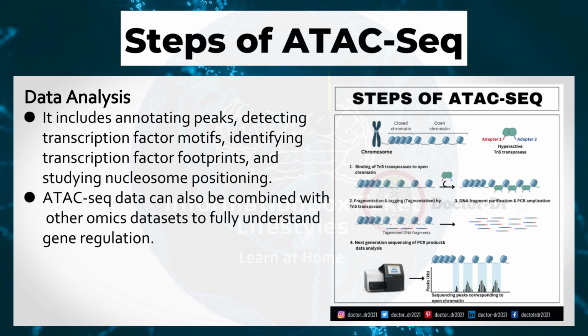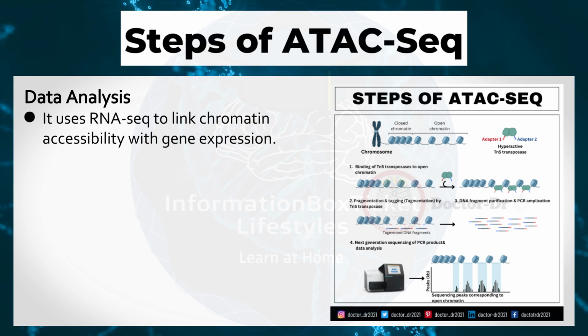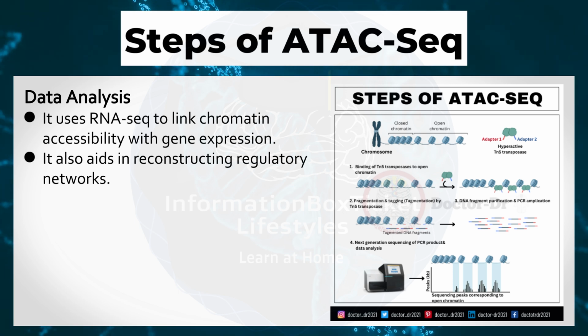ATAC-Seq data can also be combined with other omics datasets to fully understand gene regulation. Multi-omics integration enhances understanding by comparing ATAC-Seq data with chromatin immunoprecipitation sequencing to confirm binding sites. It uses RNA-seq to link chromatin accessibility with gene expression. It also aids in reconstructing regulatory networks.